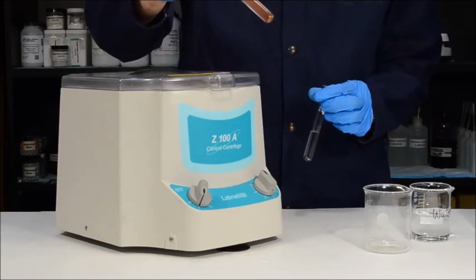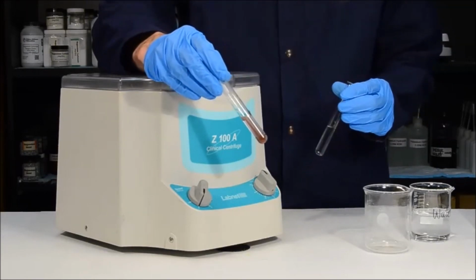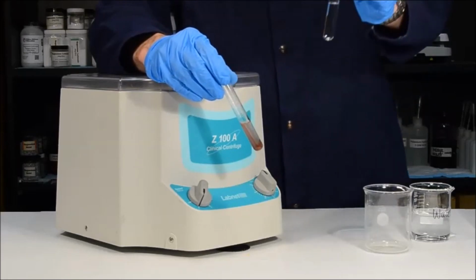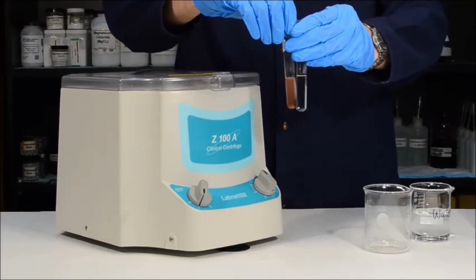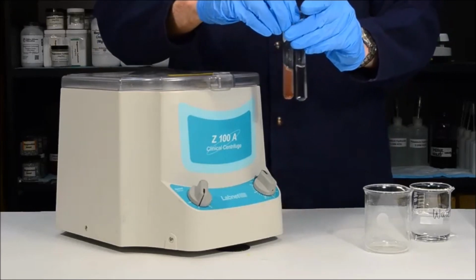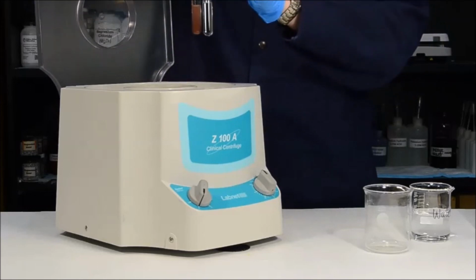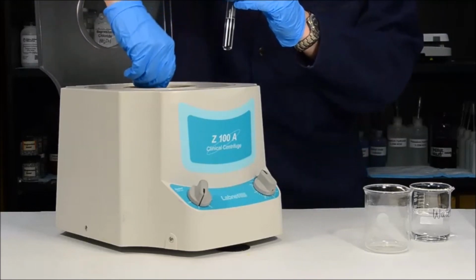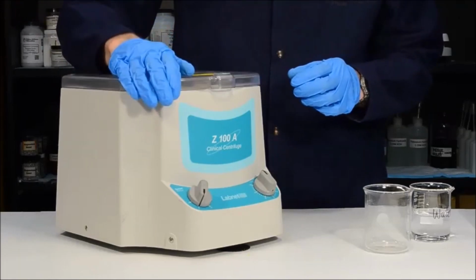We now need to centrifuge the test tube to get all of the copper metal at the bottom. Before we can do the centrifuging, we need another test tube with approximately the same volume of water in it to act as a counterweight. Once you have your blank test tube and your test tube with your reaction mixture, you want to place it in the centrifuge. Make sure that you place the 2 test tubes exactly opposite of each other.